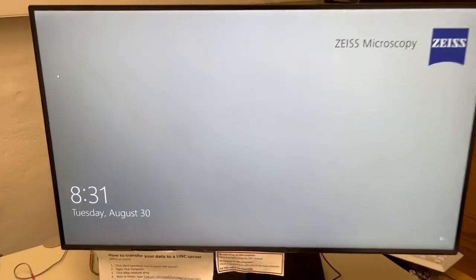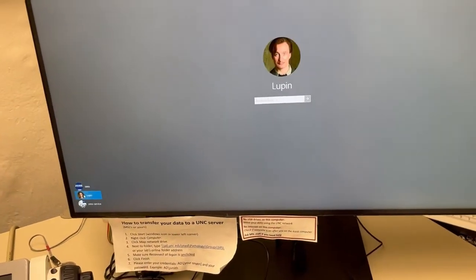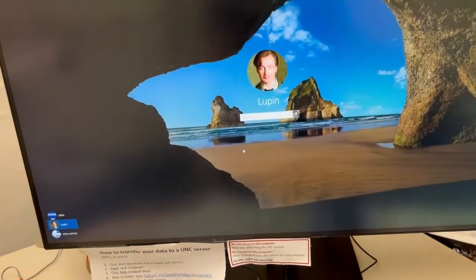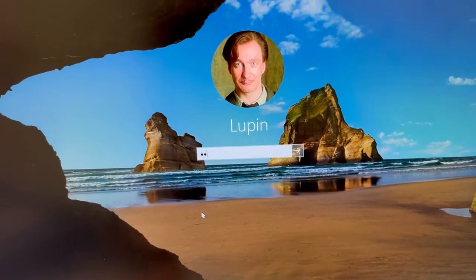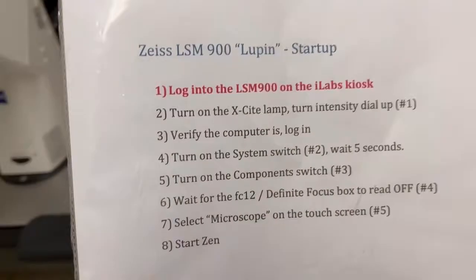We're going to log in. We're just going to click on the screen, hit Lupin — that's the nickname for this computer, in keeping with our Harry Potter theme. The password is msl, all lowercase. Hit enter. So that's complete.